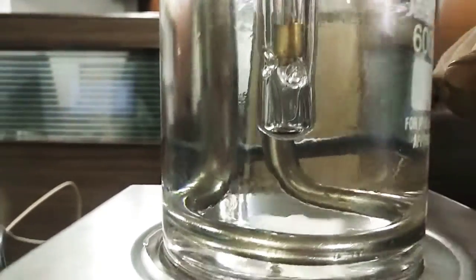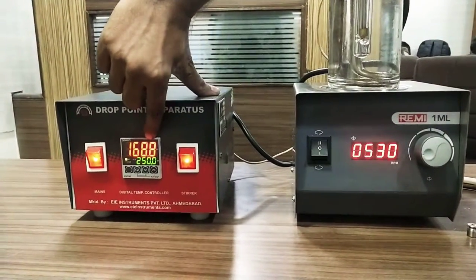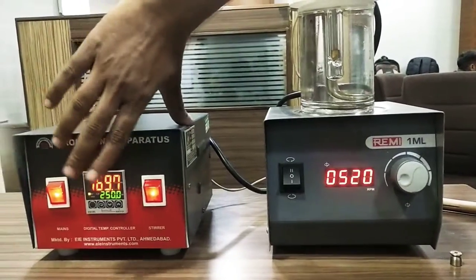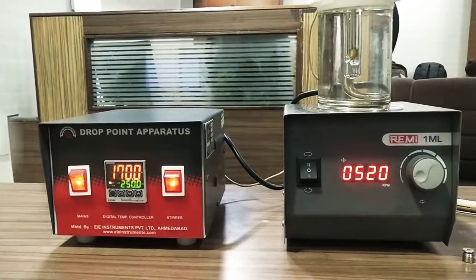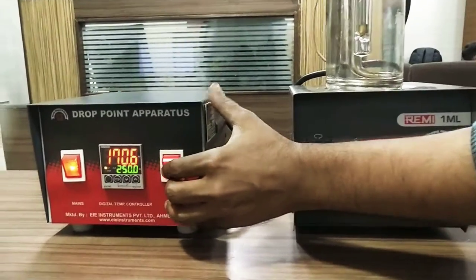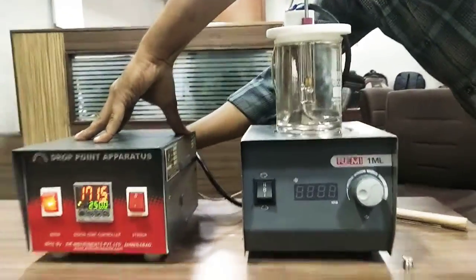Note the temperature when the first drop is observed. We have to note this temperature: 168.5. After that we have to stop the heating and remove the heater cable.